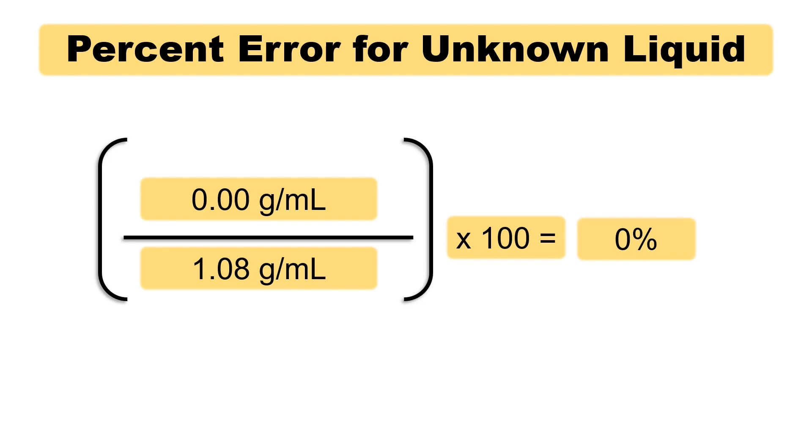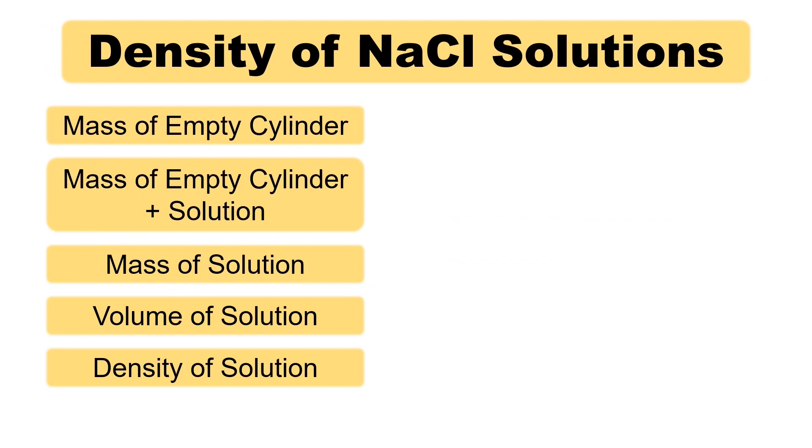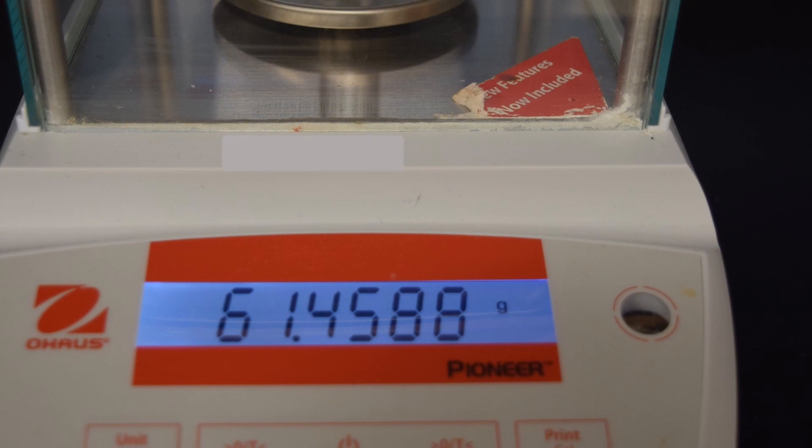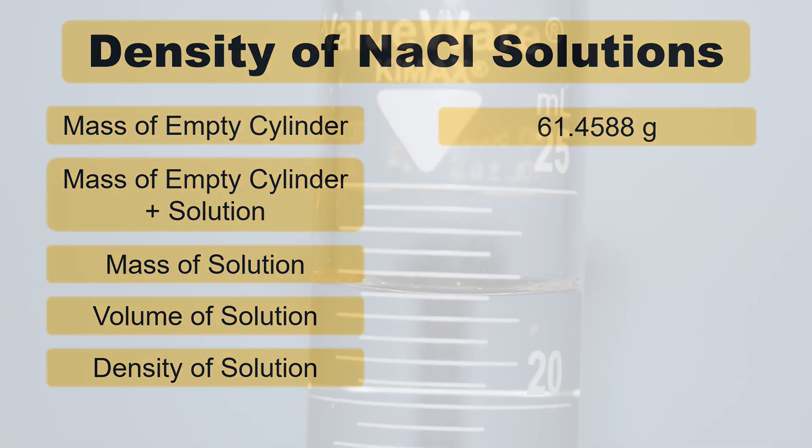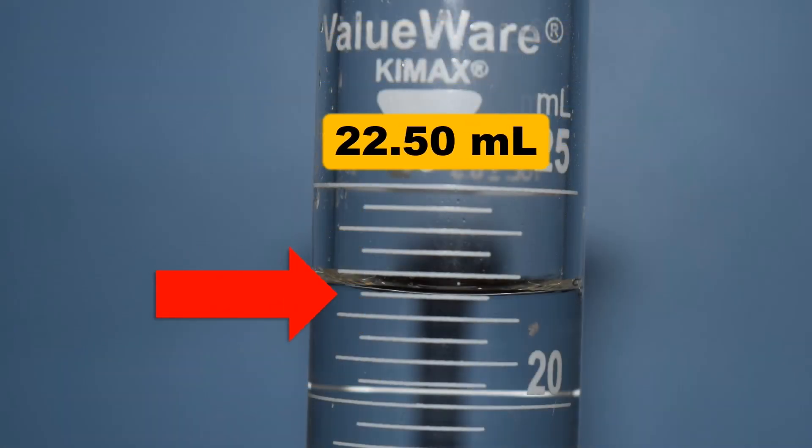Now, let's do one example to find the densities of solutions. Again, we'll use the same procedures as finding the densities of liquids. We'll use prepared 5, 10, 15, 20, and 25% sodium chloride by mass concentrations. For this video, I'll only show the 20% density determination.